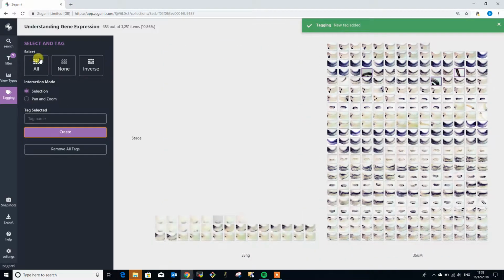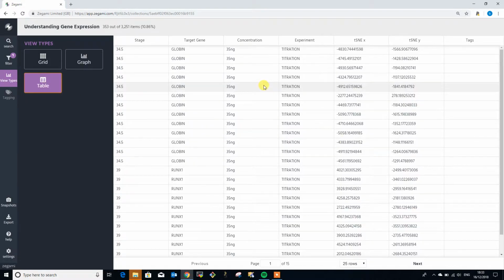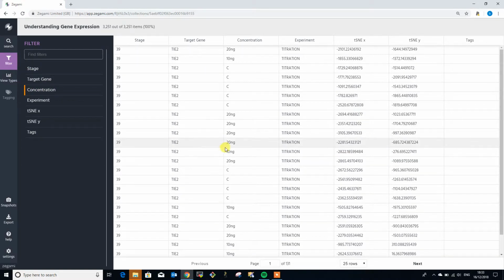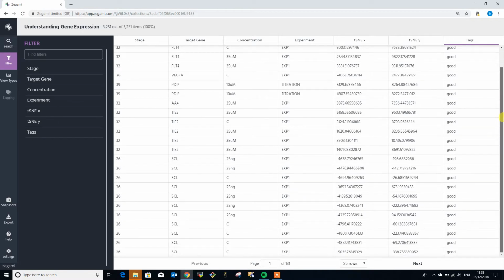And these can then be exported as a table to a machine learning tool. So you could actually get the machine learning with supervised learning to be able to see these. So we should see this is stuck on stage 39. Okay, so you can see all these different tags here. Okay, that's the end of this particular demo.